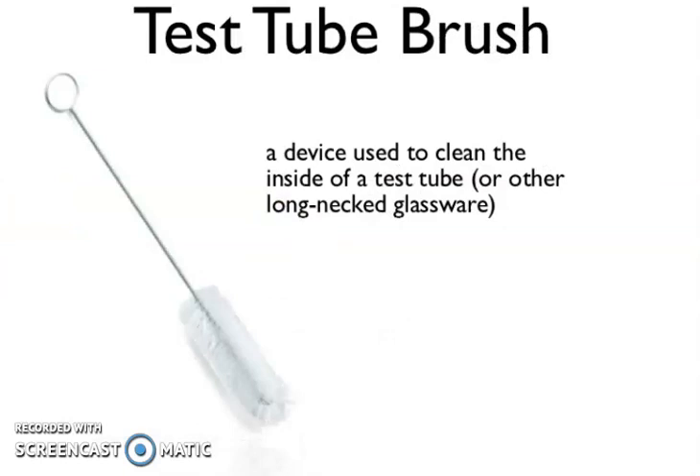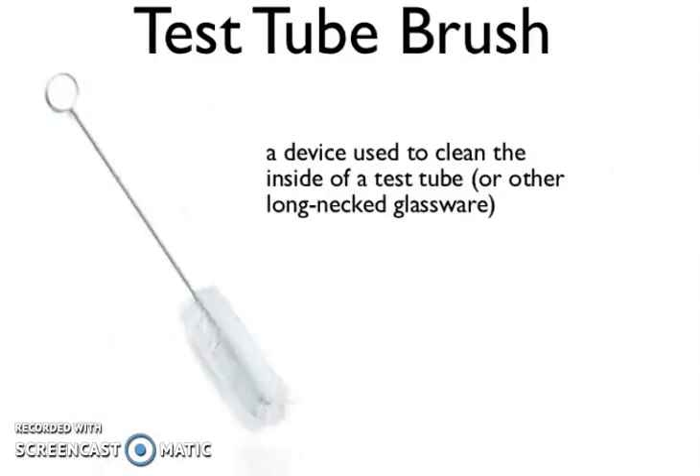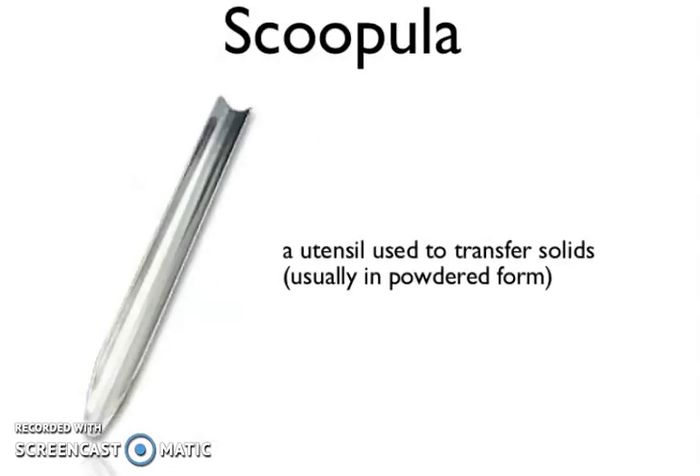This is a crucible. Now you can see a test tube holder — a gripping device used to carry a test tube after it has been subjected to heat or cold temperature. Now, test tube brush — a device used to clean the inside of a test tube or other long narrow glassware. This is very useful in the chemistry laboratory.